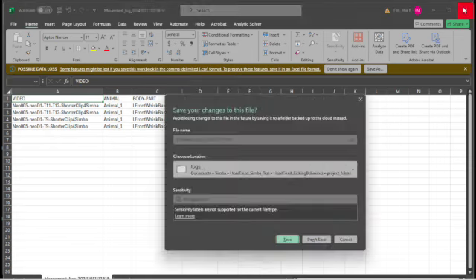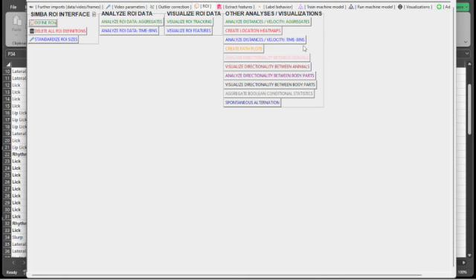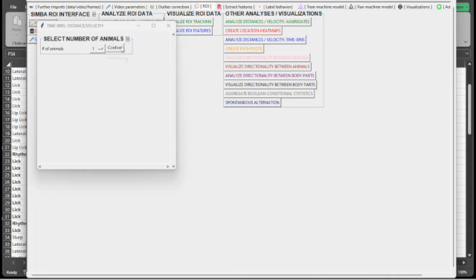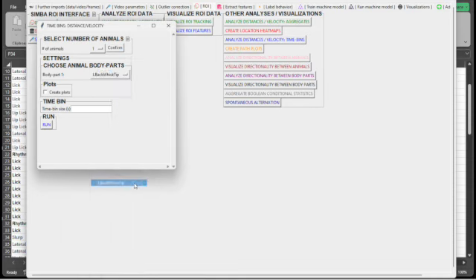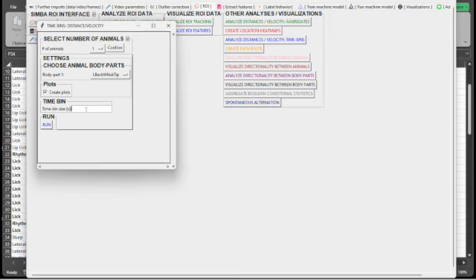video. It might be that if I analyze the distance or velocity in time bins, that will be more helpful for me. So if I'm looking at, maybe, left back whisk tip, and create a plot in my time bin size. I want to be, let's see, whiskers can move at up to 30 hertz.